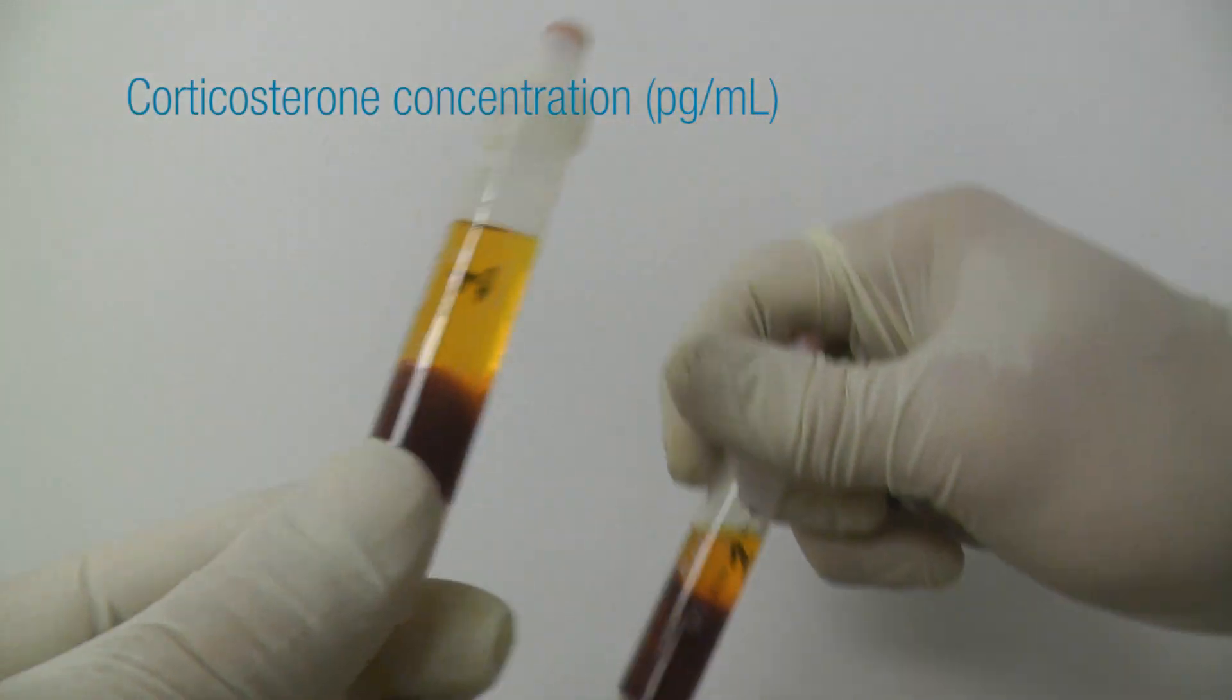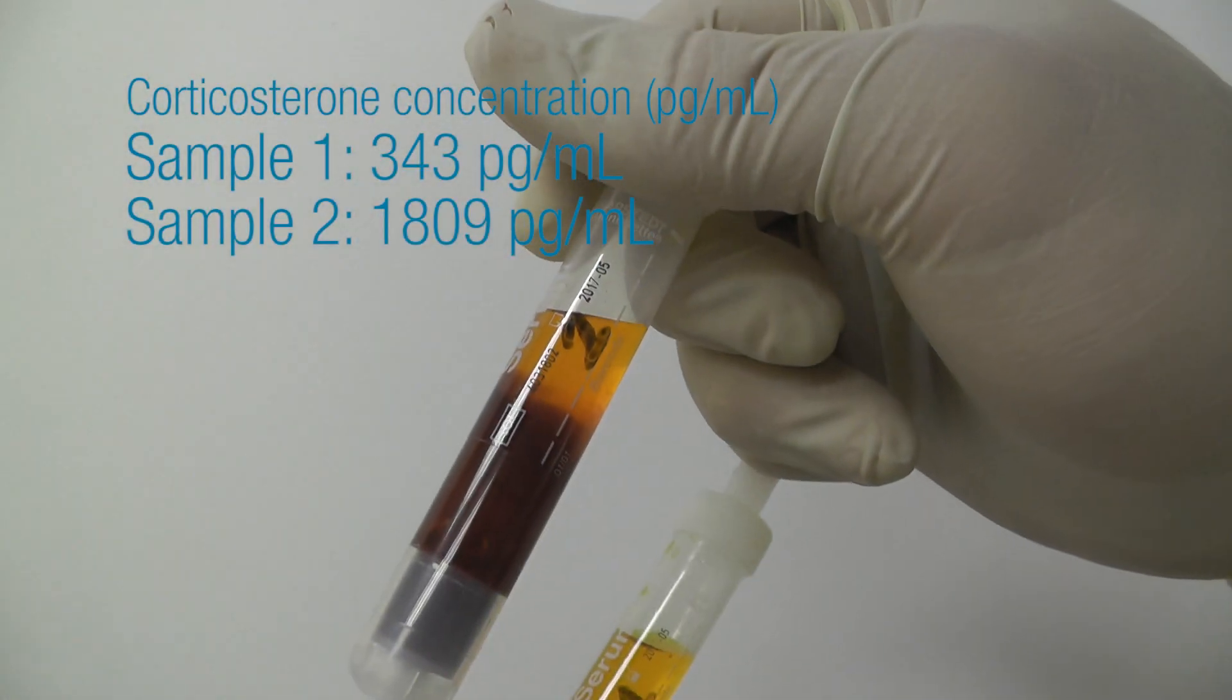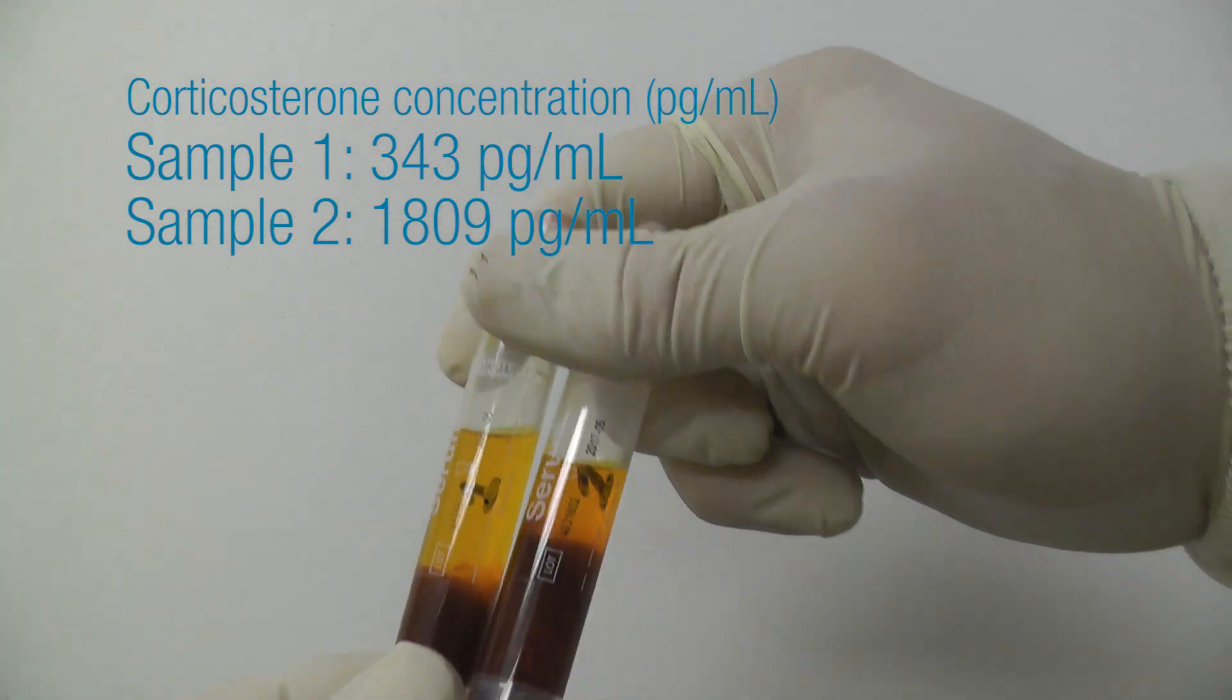By extrapolating our sample OD readings on our generated standard curve, microwind determines the concentration of our unknown samples.